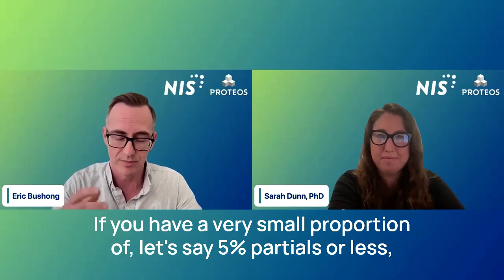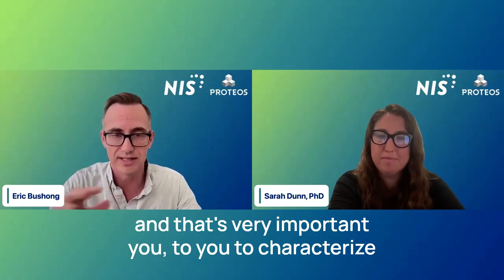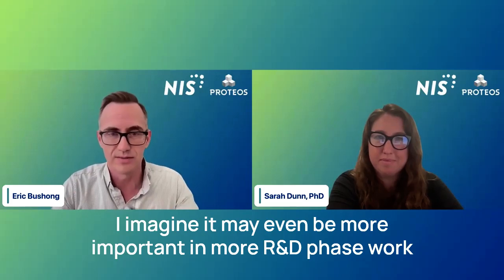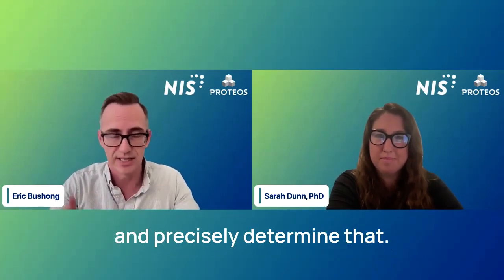If you have a very small proportion of, let's say, 5% partials or less, and it's very important to you to characterize that from sample to sample, I imagine it may even be more important in more R&D phase work than in an actual final GMP study. But nevertheless, that might be a situation where we decide we need to have more particles in order to be able to confidently and precisely determine that.